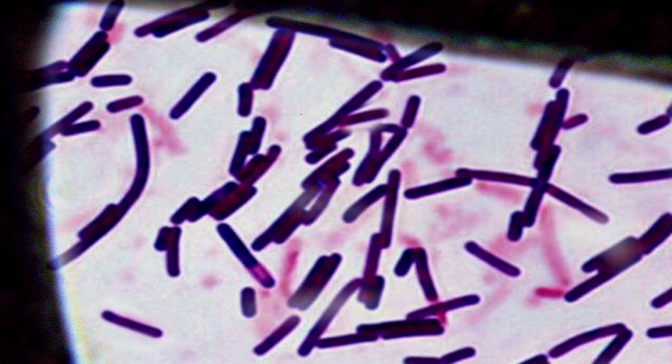An enlarged micrograph takes us past the resolution limit of the light microscope and now I'm adding the image of a 100 nanometer coronavirus particle. Can't make it out. Here it is.